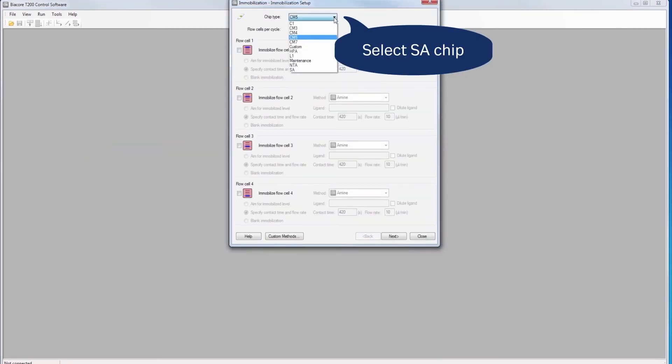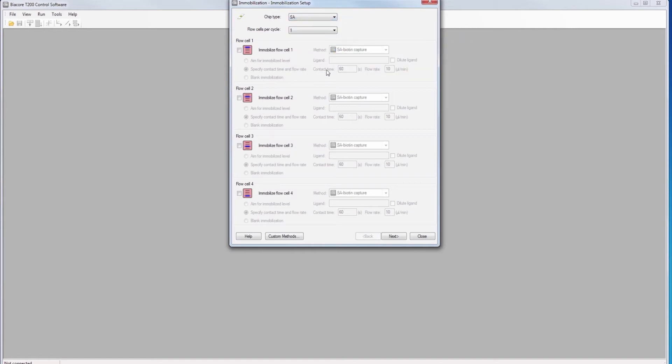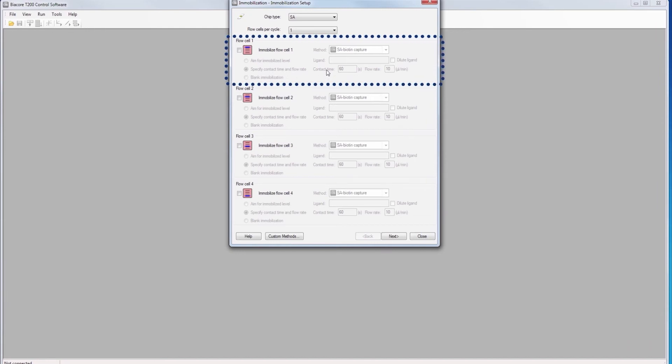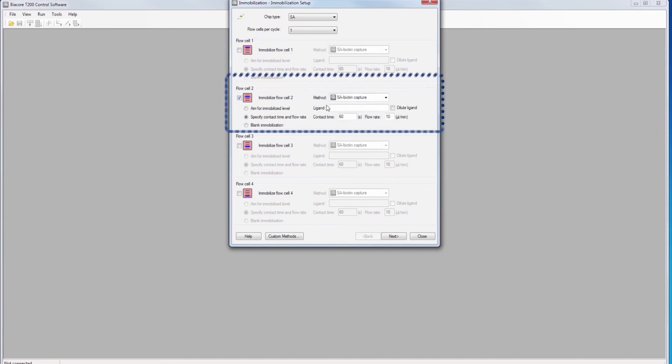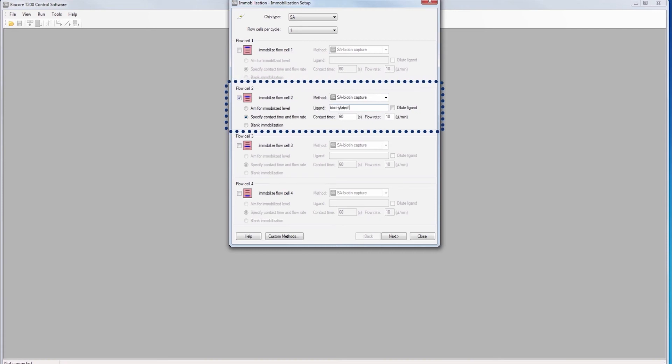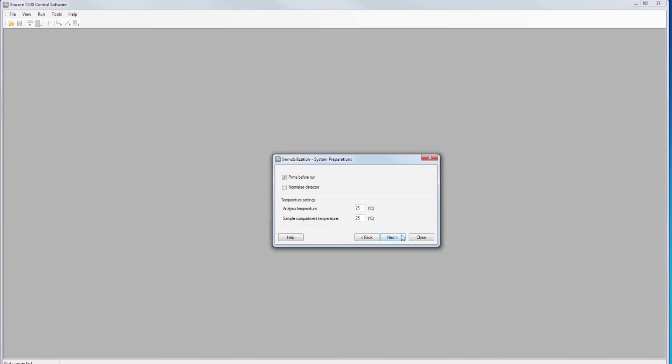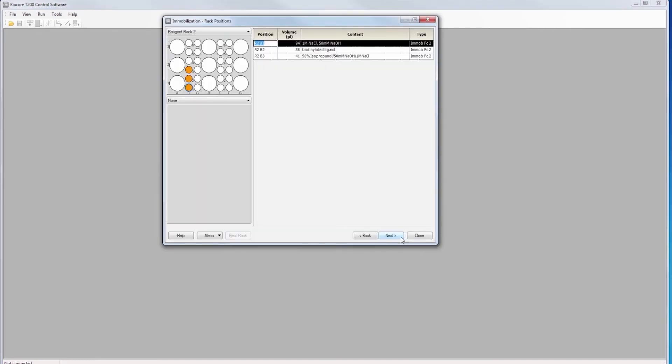Scroll down the chip type menu and choose SA chip. SA biotin method is used. Unmodified flow cell 1 is a reference control for the capturing molecule. We will use flow cell 2 for capturing our biotinylated ligand. The system needs to be prepared with a prime with running buffer before operation.